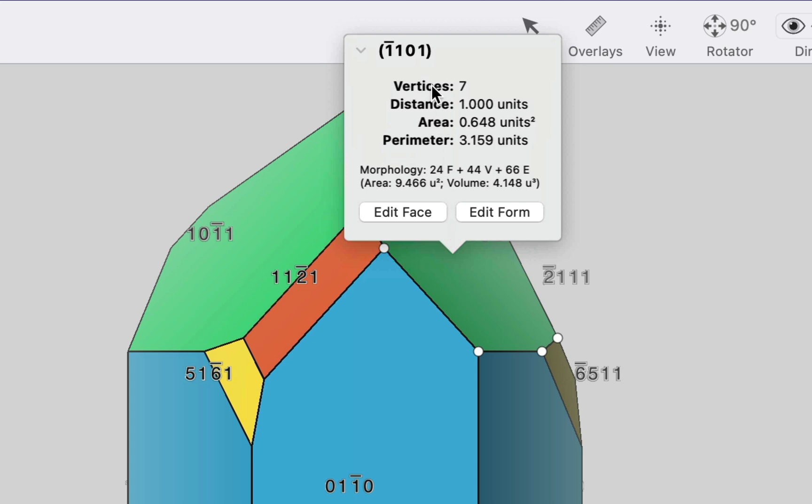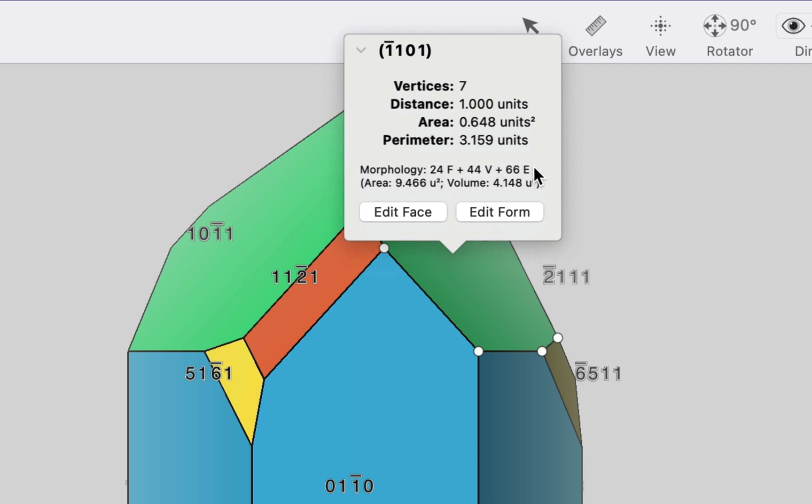We have the number of vertices. We have the distance of the face to the centroid of the crystal. We have the surface area, the perimeter. And then we've got some basic morphological data. The number of faces that the shape has. The number of vertices that the shape has. And the number of edges. And then we've got the overall surface area and the overall volume.